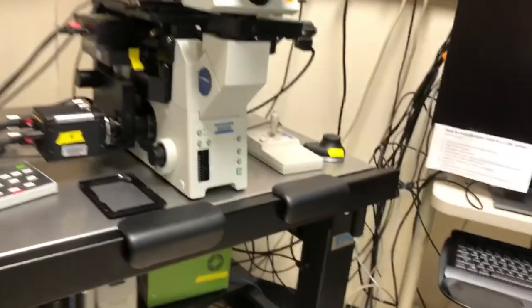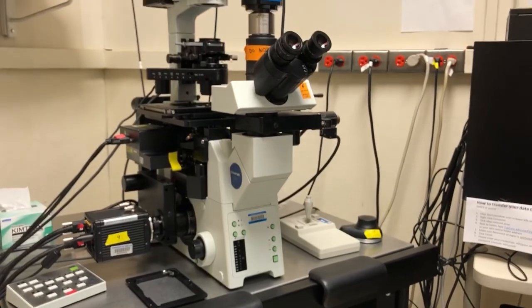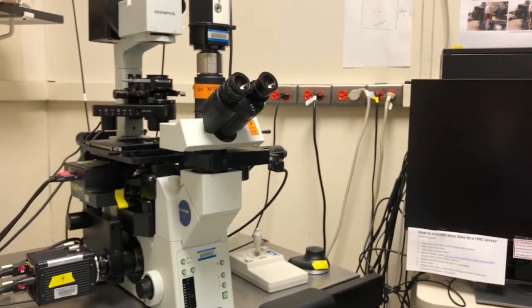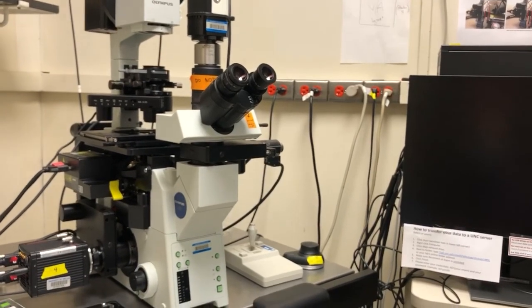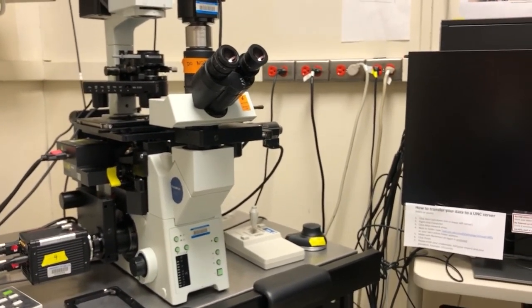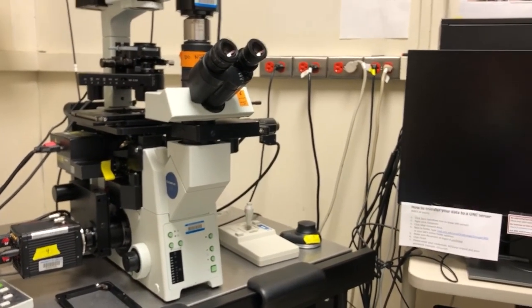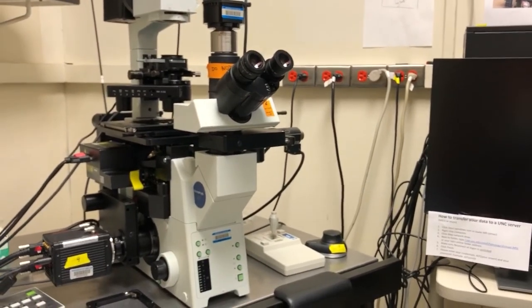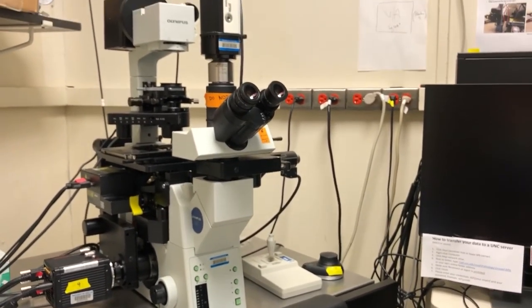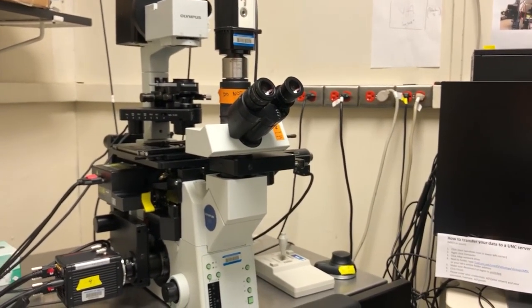That's it — that's how you take simple bright field images on the IX-81. I hope that you found this useful. I'll have other videos on how to take bright field tiling on the system, as well as how to do fluorescence and fluorescence stacks for wide-field deconvolution. There will be links to those inside the IX-81 playlist. If you have any questions, just email me and I'll be happy to talk to you.